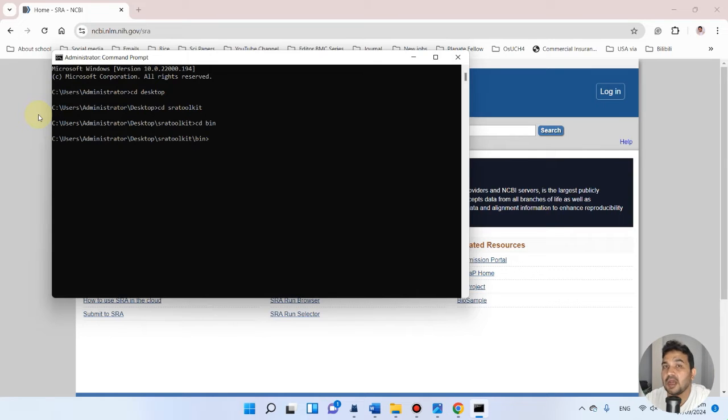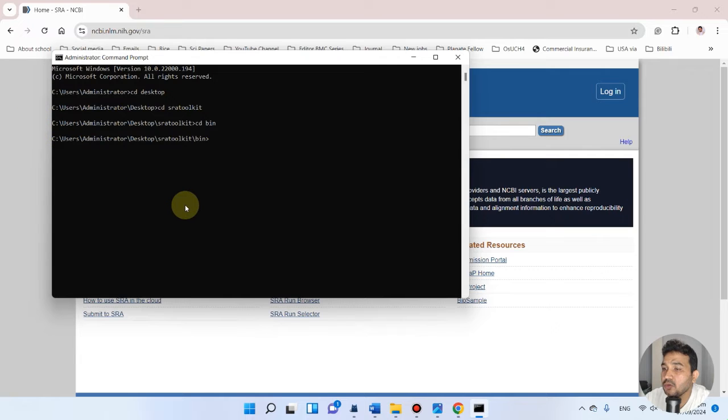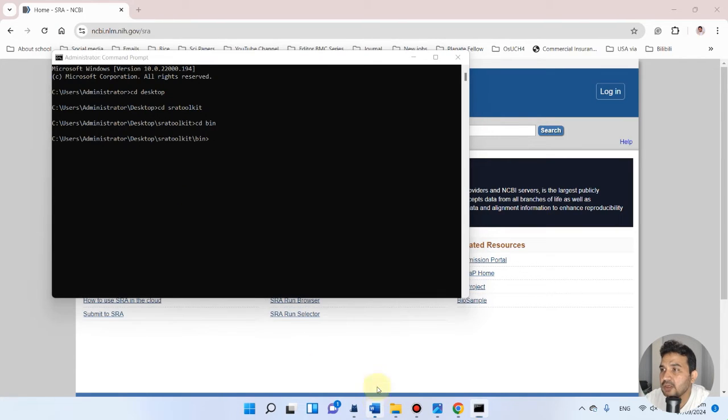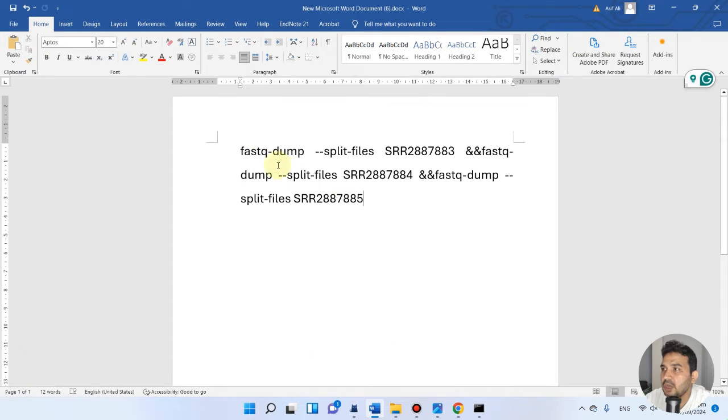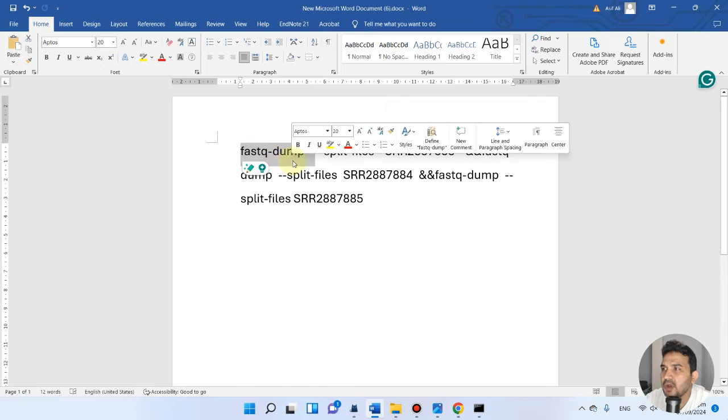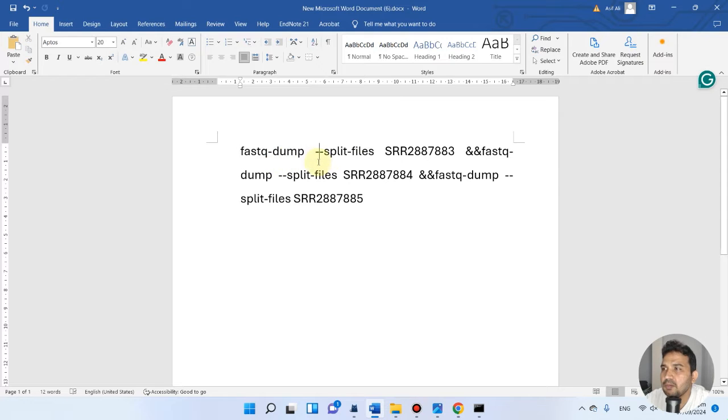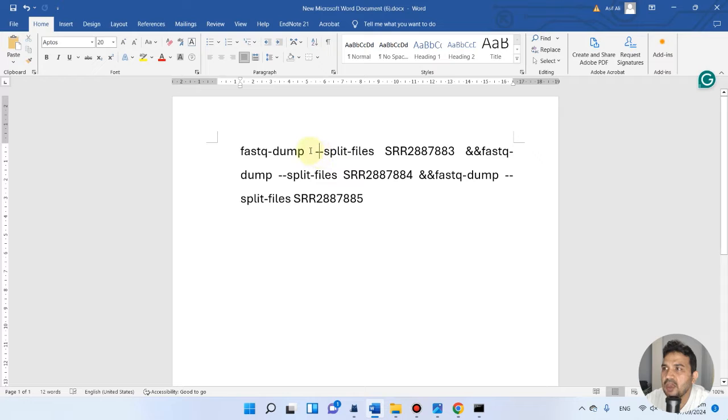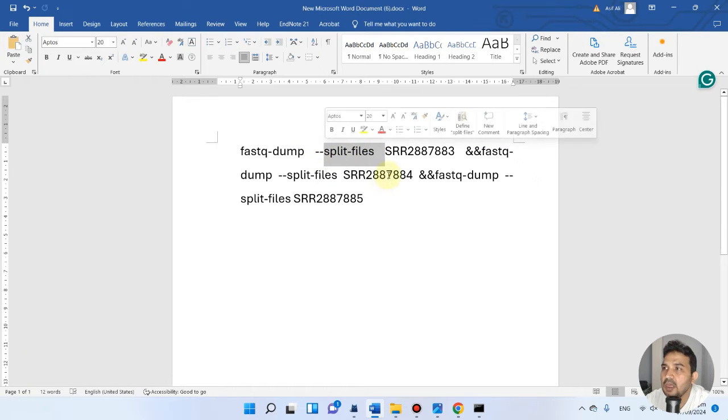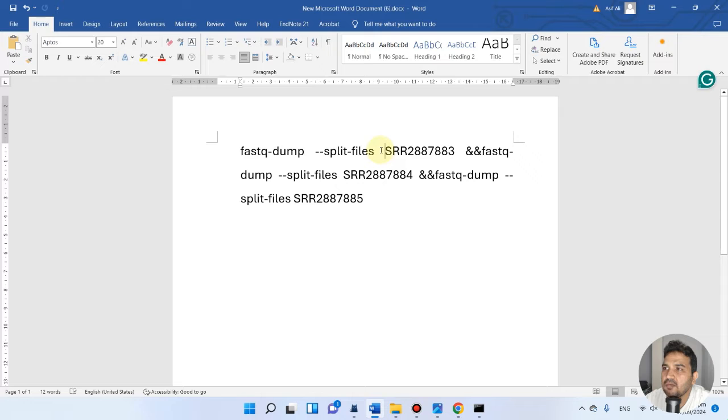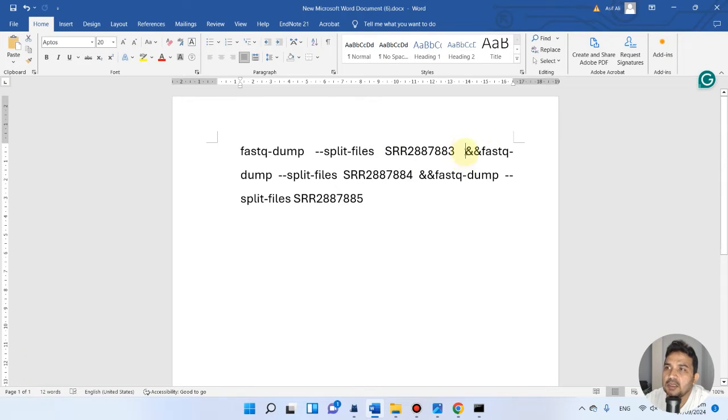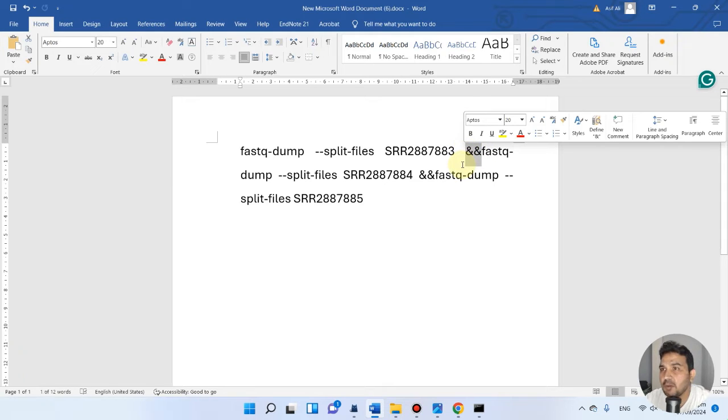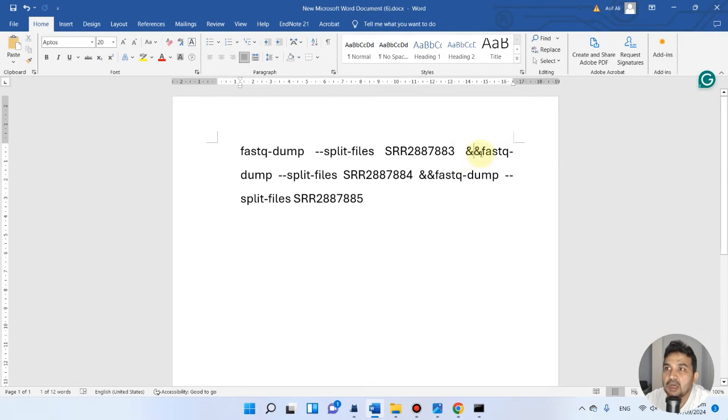Now let me show you how you can write your code in this command prompt for multiple SRA accessions. We can write code like: fastq-dump, then put a space, then minus minus, then split the files, then enter the accession number one. Then we can put a space and start the next one, telling the command prompt that after downloading this one, start the next one, which is fastq-dump again.